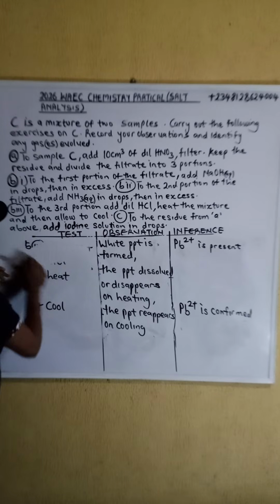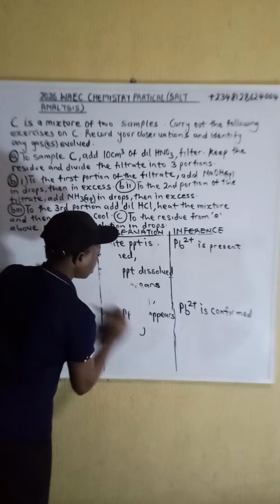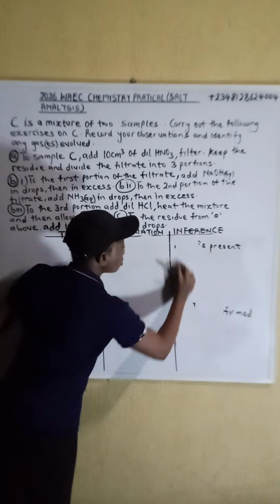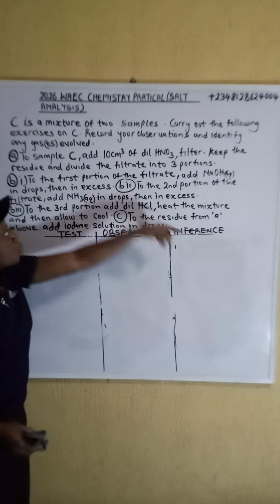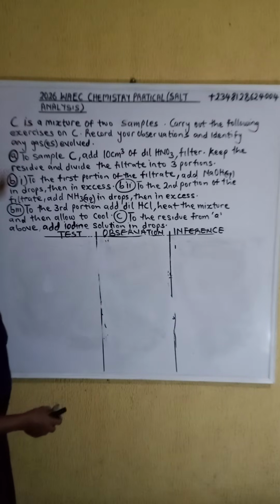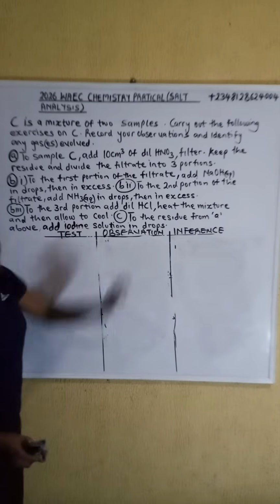Now let's move to question C. Question C says that to the residue from A above, add iodine solution in drops.